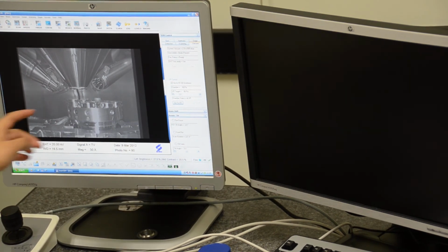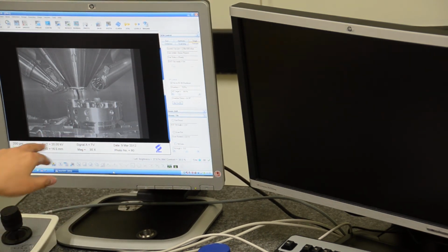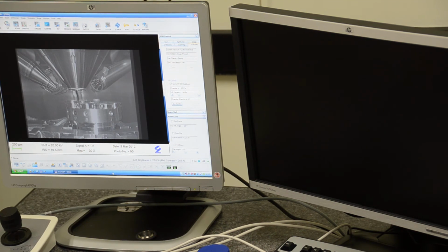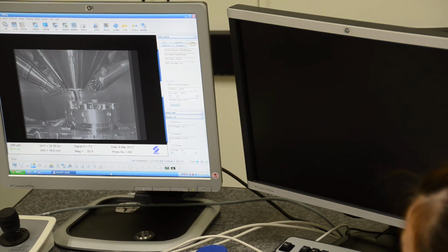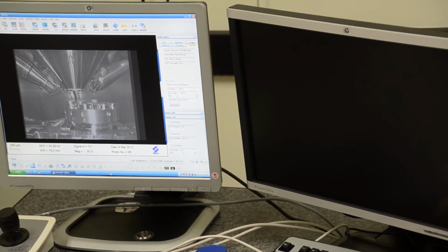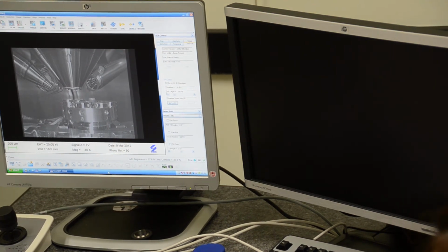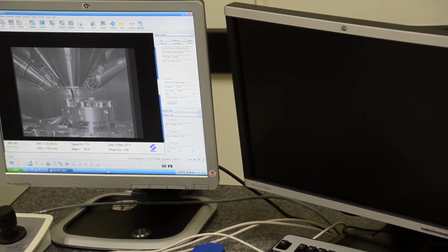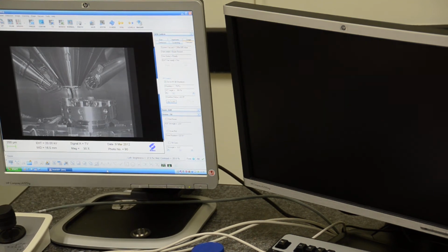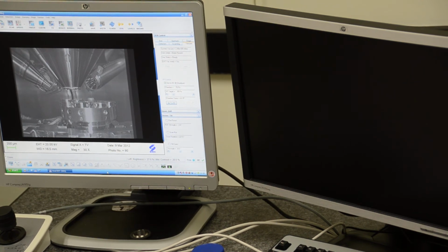Another thing is that because the system is in a very low vacuum, with so many molecules, it not only affects the SE signal, but it also affects the primary electron. The primary electron initially wants to stay in focus after leaving the column, to reach the sample. But because of the molecules there, the electrons may separate.